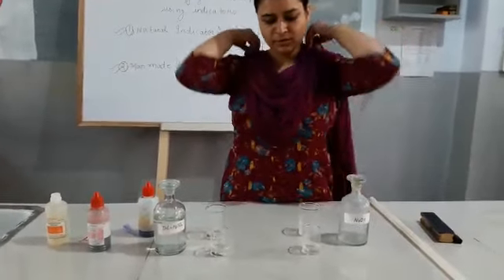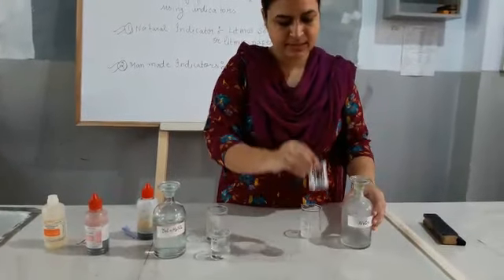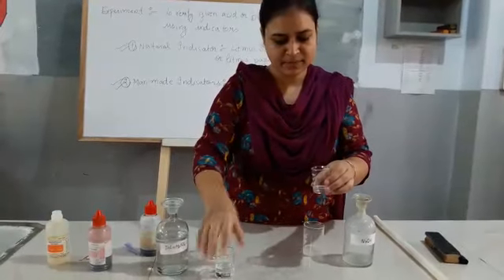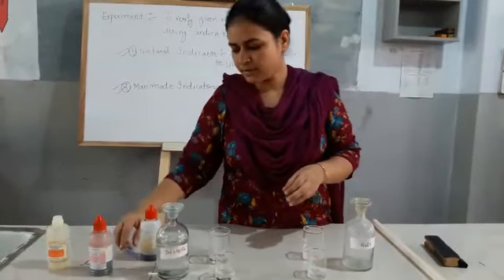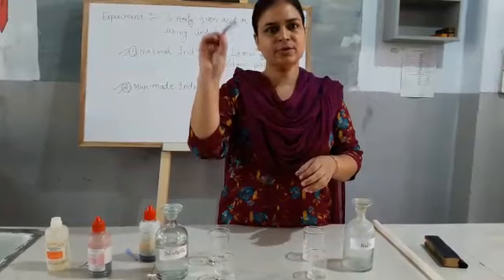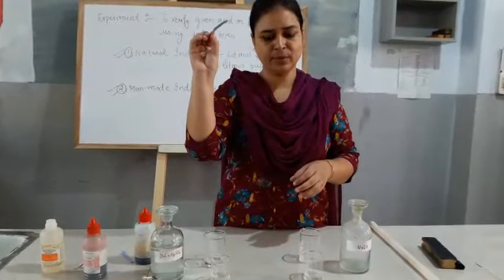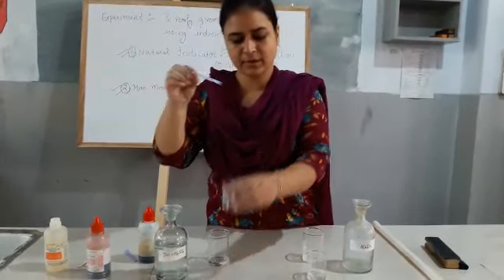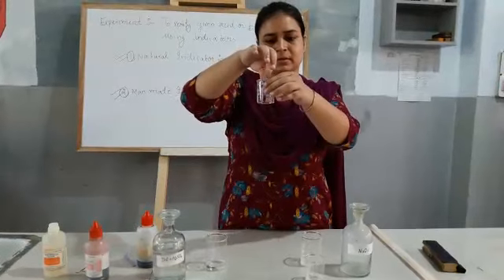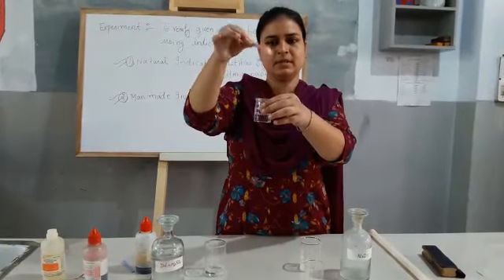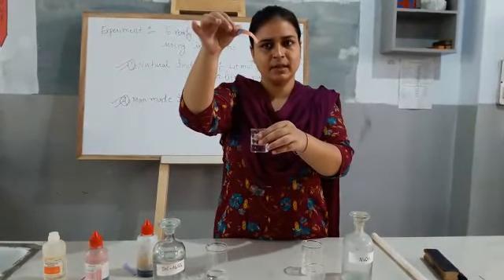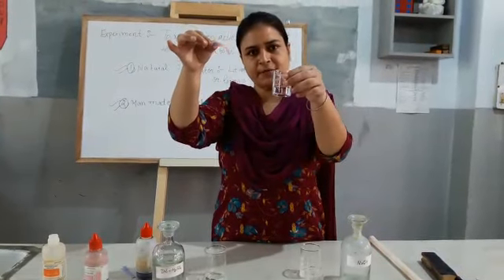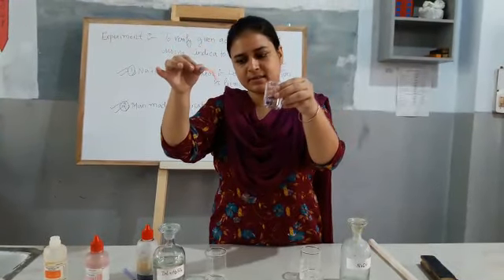First, as you know, this is a base and this is acid. I am doing the test with the help of the strip — this is the blue strip. As you know, acid turns blue litmus paper to red. So check it out. See the color change — the blue litmus paper changes to red. This verifies that this beaker contains acid.